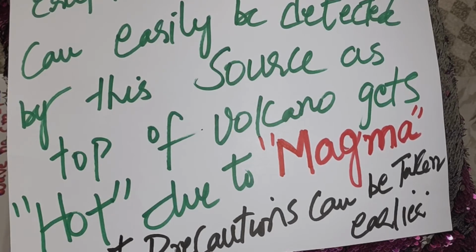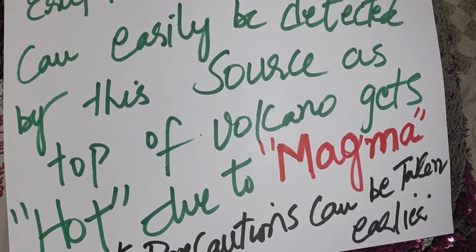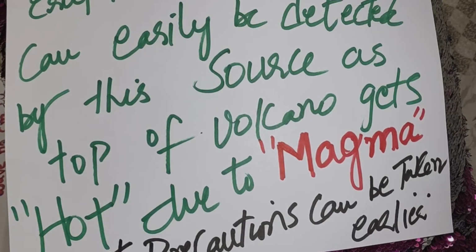So this is also one of the very interesting uses of infrared spectroscopy and infrared analysis. I have shown you a number of uses. There are many, but I have shown you only a few, the most recent and most modern ones, which nowadays appear in research journals.